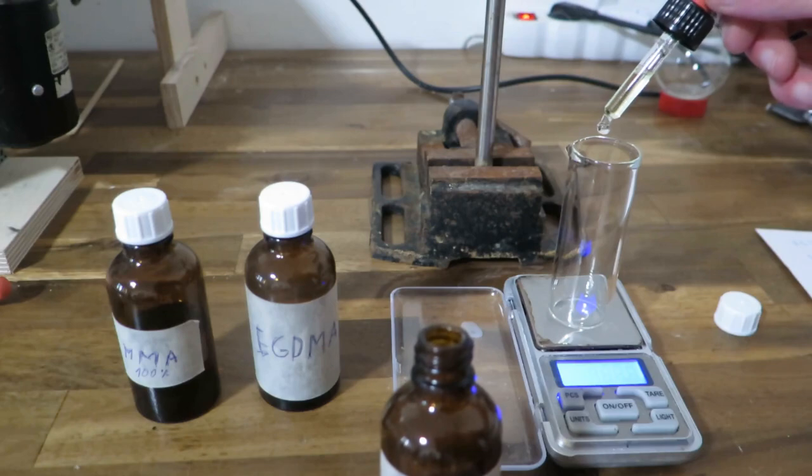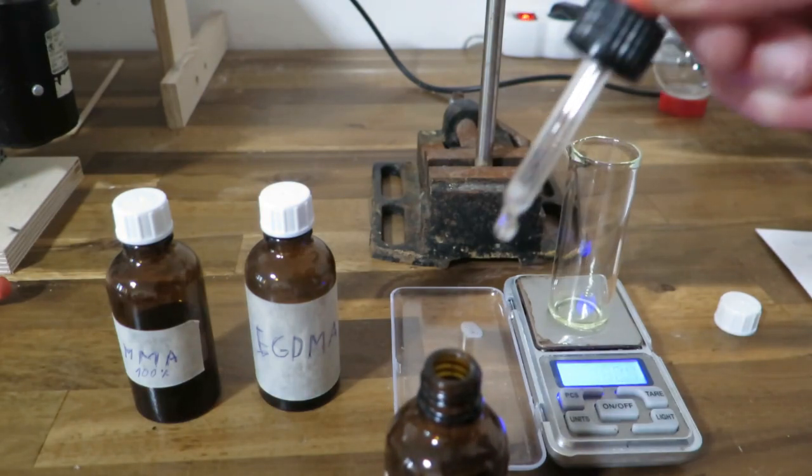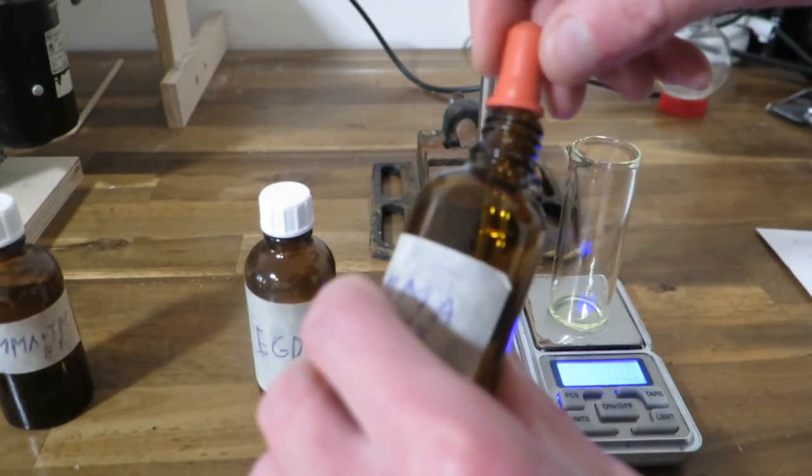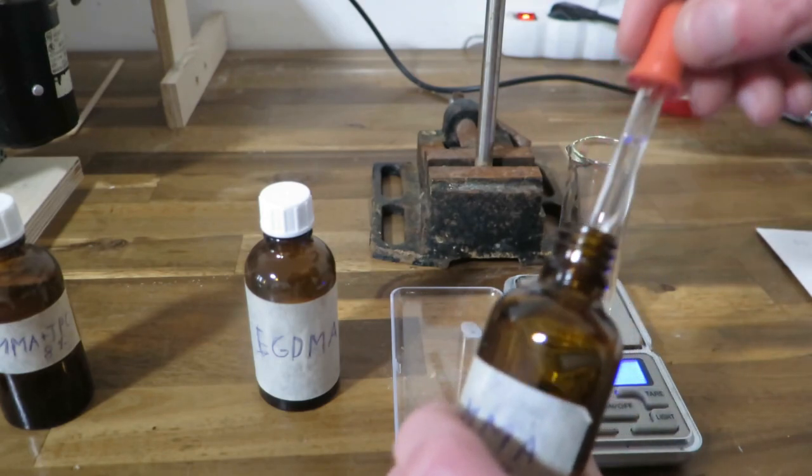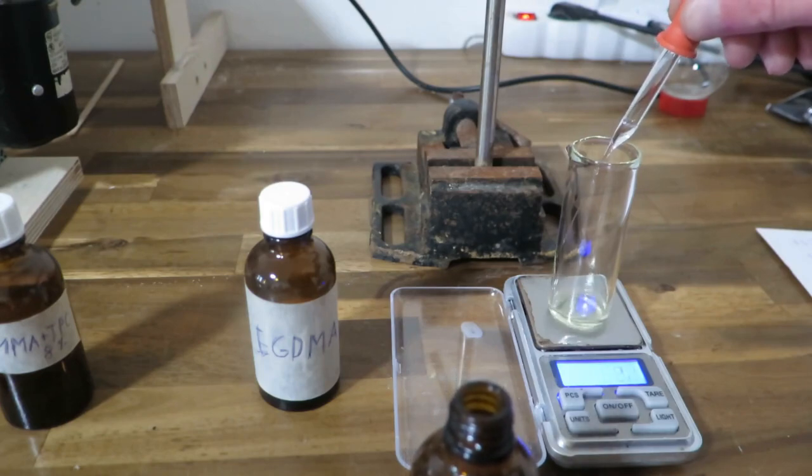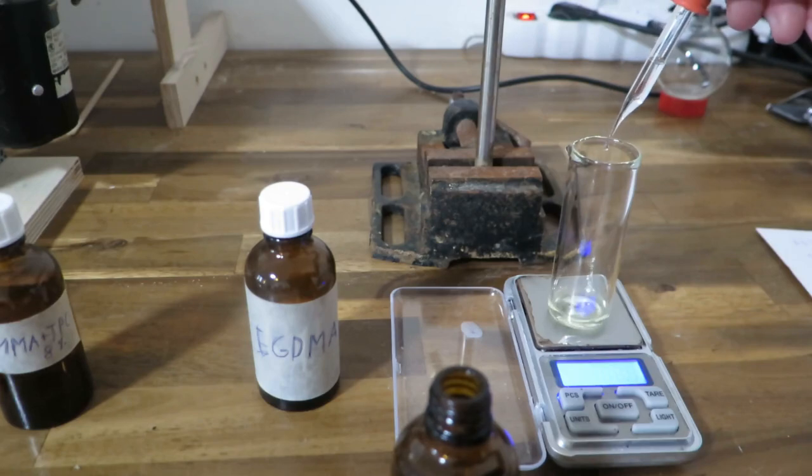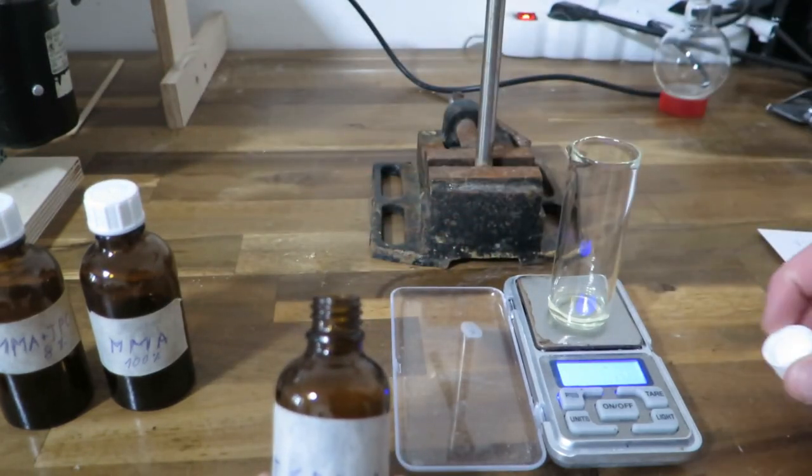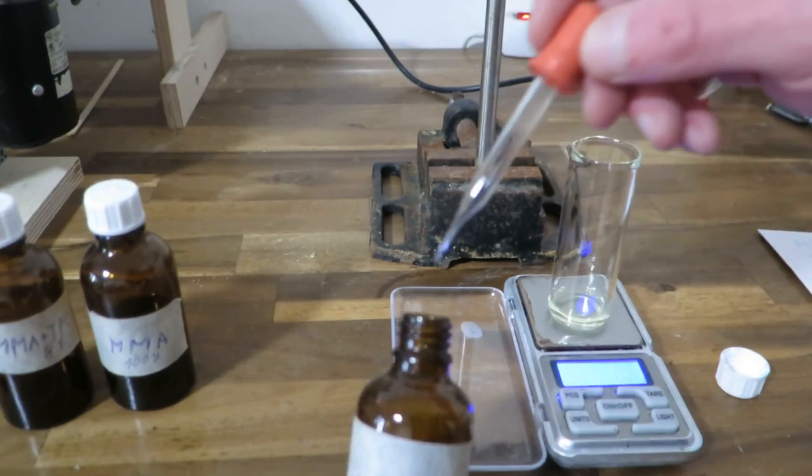I've got 8% solution and I need about half gram of it. Then you need 1.5 grams of methyl methacrylate pure, that should add up to about 2 grams. And finally I will use half gram of this ethylene glycol dimethacrylate.